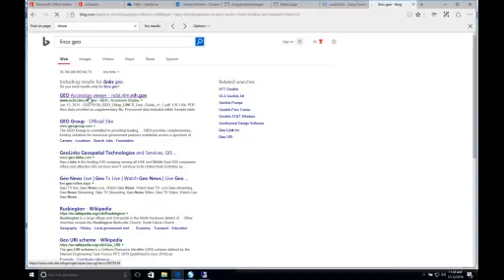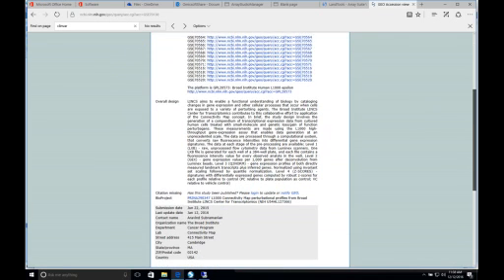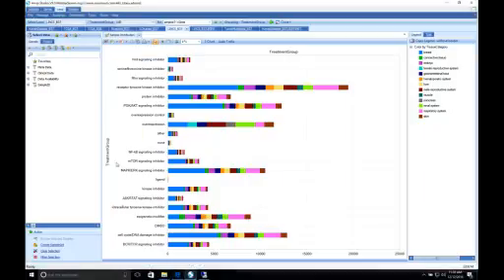So this is a data set, the Library of Integrated Cellular Signatures. It's an NIH program where they basically took different types of treatments and other different types of profiles across a number of different cell types. And so we have expression data on all of it. There are a ton of samples in this data set. And it's not something that I've personally spent a whole lot of time with because we just got our hands on it over the last couple weeks.